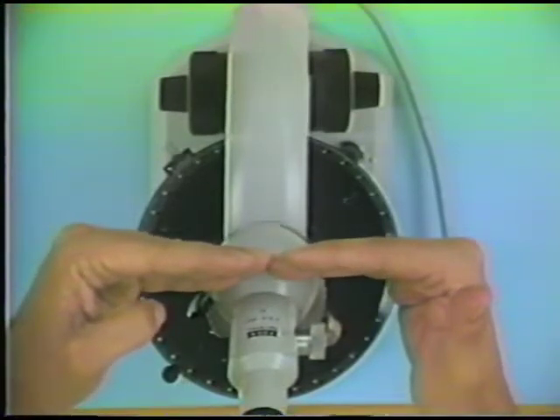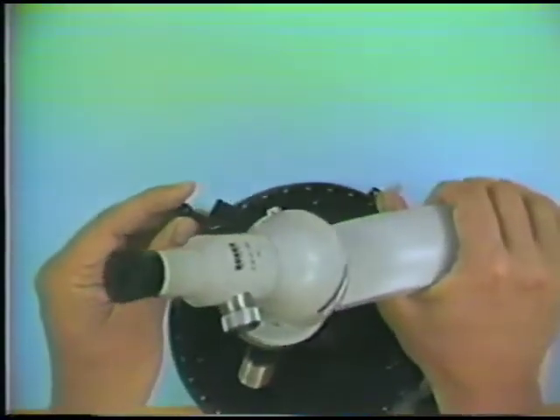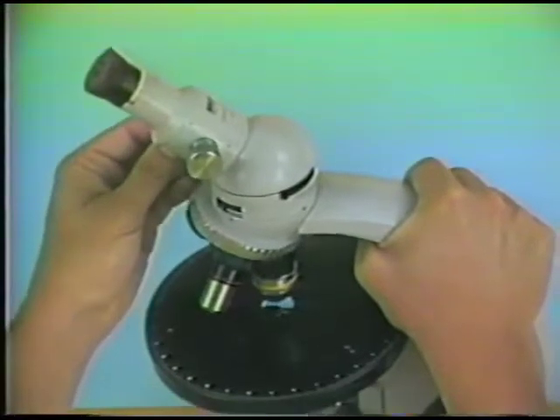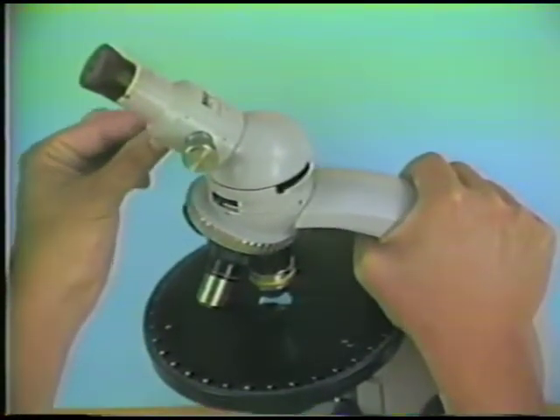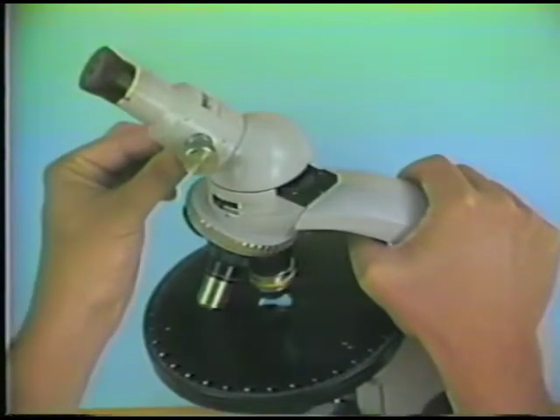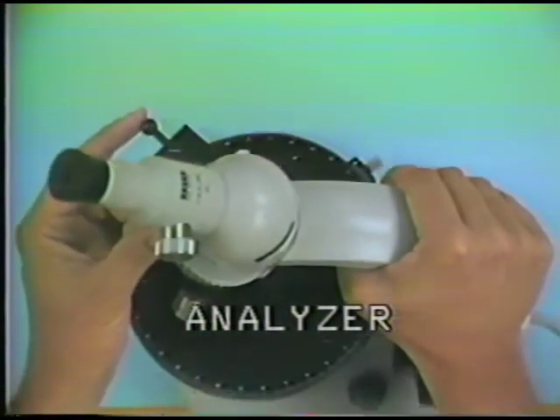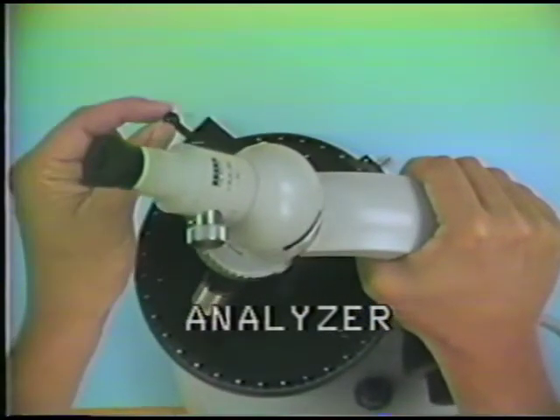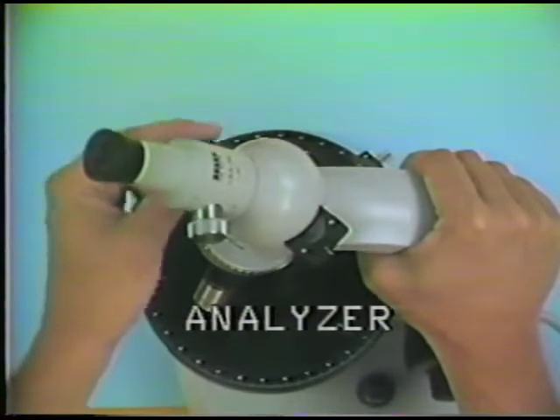Now above the stage of the microscope, in this position, right here, there is another polarizer. This polarizer is called the analyzer, and it's got a lever device on it, a pull device on it, which makes it very easy to put it in and out.